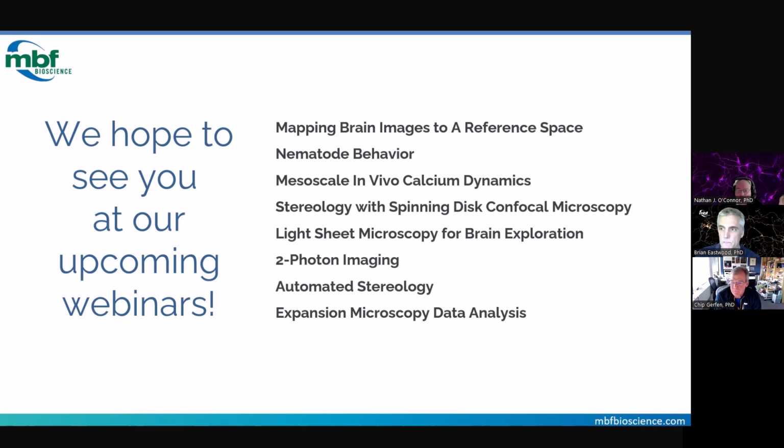Here's a question, Chip. I know you like this one. How long did this whole process take you from staining to final 3D volume construction? Just wondering about the time-taken comparison between this method and the clearing tissue plus light sheet imaging.